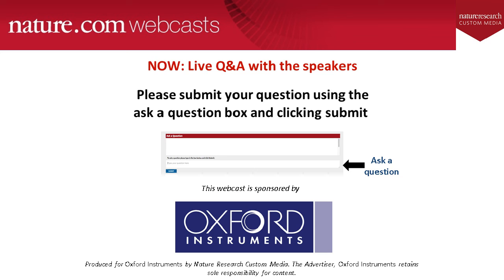Excellent. Thanks, Louise. Our next question asks, if one is using a windowless detector, how does one protect the detector itself from surface contamination? Erin? Oh, I can answer this one from a user perspective. So basically you have to make sure that whenever the detector is cooled, the microscope's under vacuum.